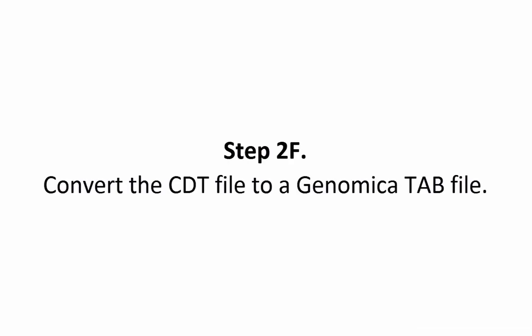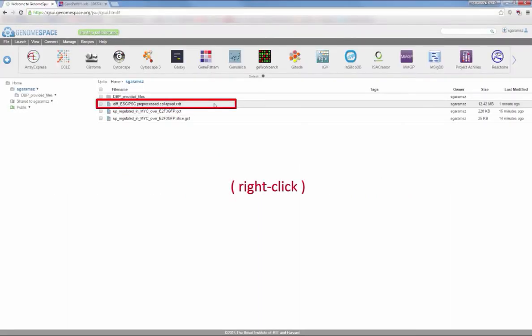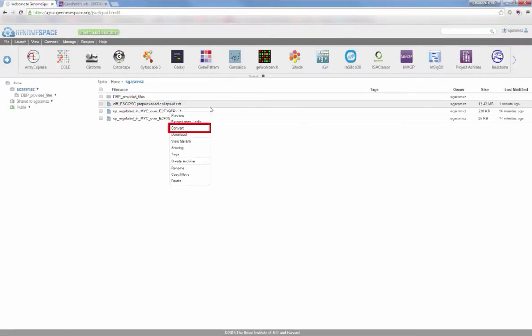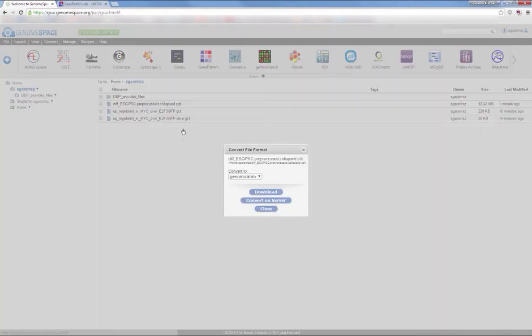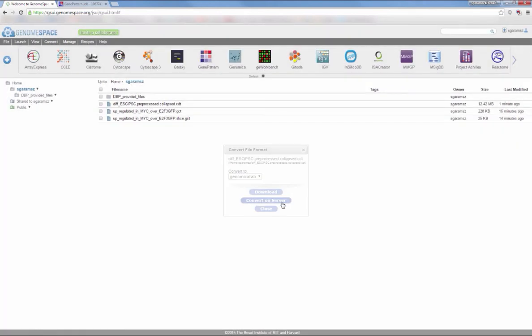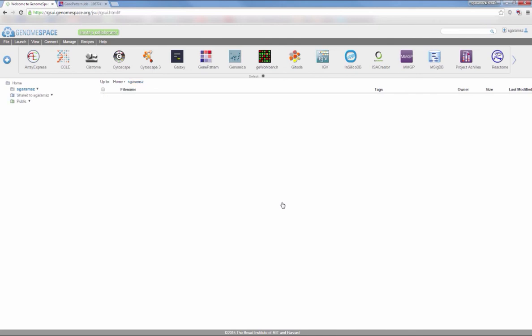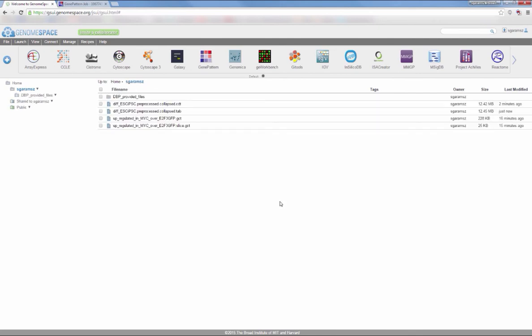Step 2f. Finally, convert the CDT file to a Genomica tab file. Right-click the recently saved CDT file and choose Convert. Ensure that you are converting to Genomica tab, and click Convert on Server. Once the conversion has finished, a new tab file with the same prefix name should appear in your folder.